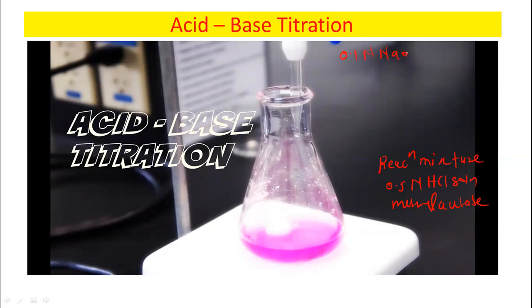Suppose we have taken 5 ml of this reaction mixture and the HCl has concentration 0.5 normal, then the approximate first reading after the mixing will be around 25 cm cube. The expected reading is 25 cm cube.